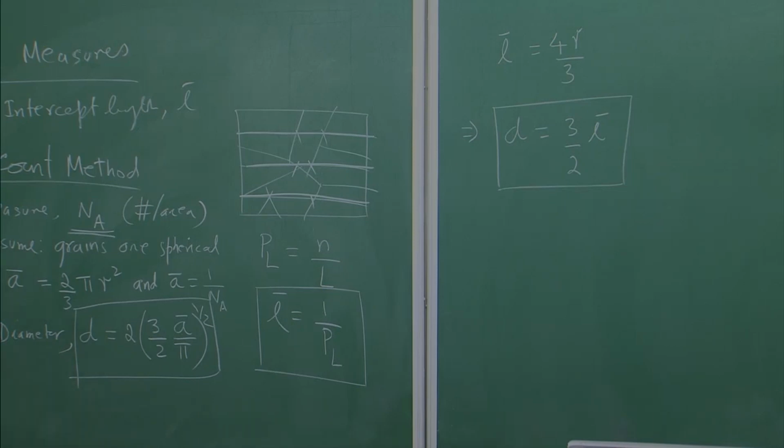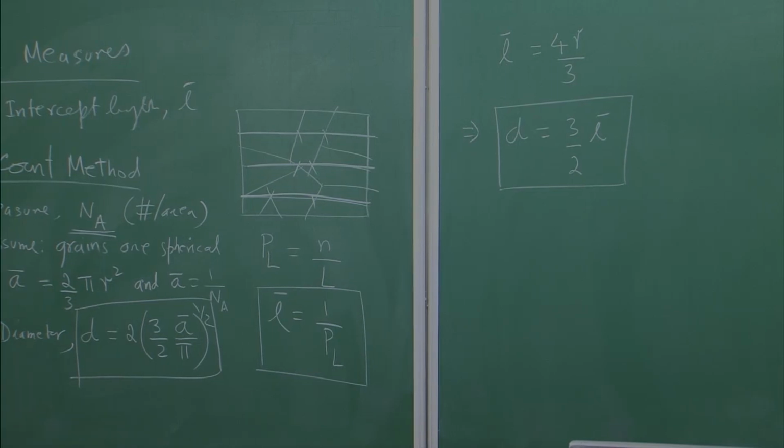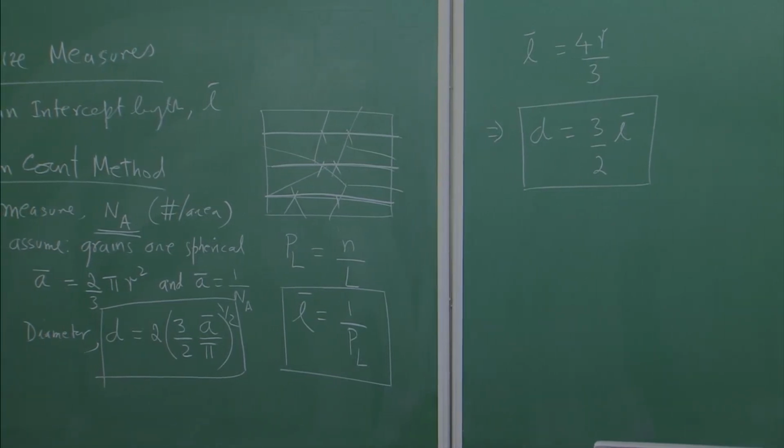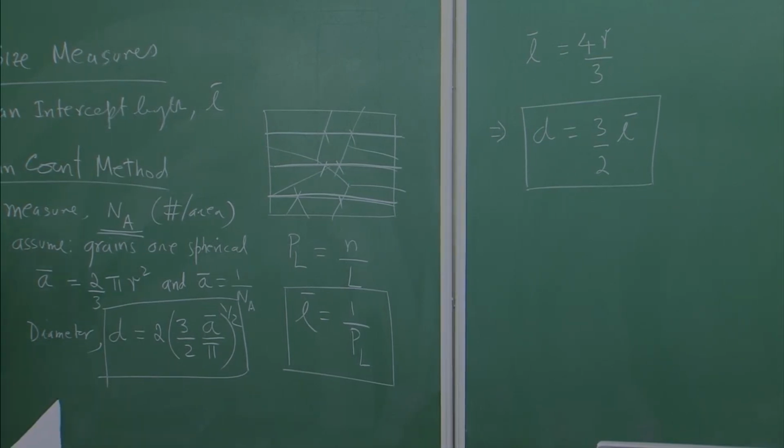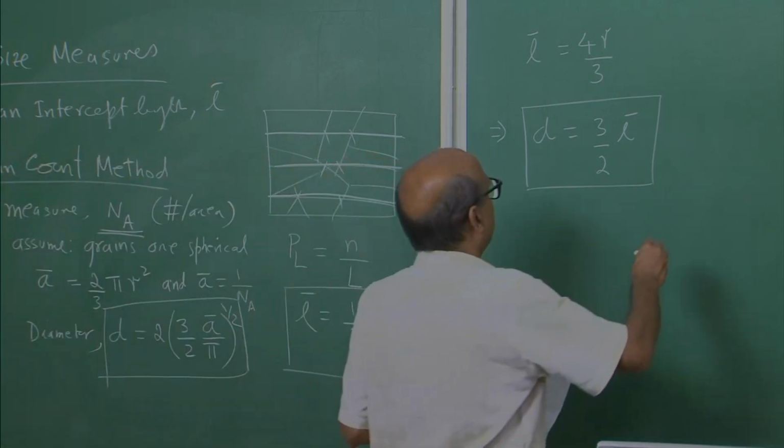Now, there is a third and final measure of grain size that I want to introduce today, and it is still used in industry quite a lot, the ASTM grain size parameter.